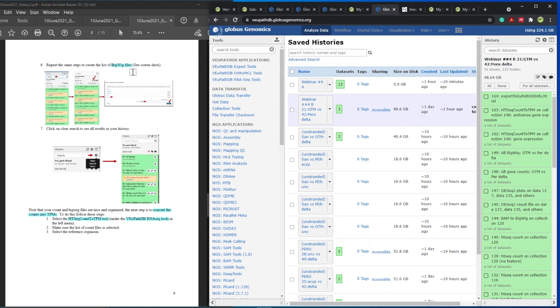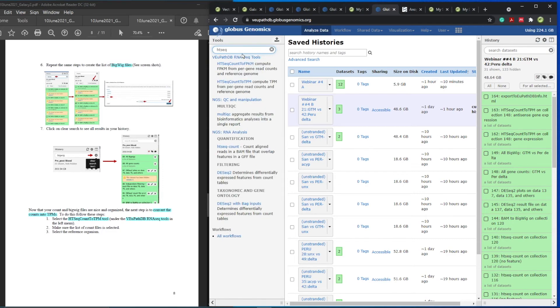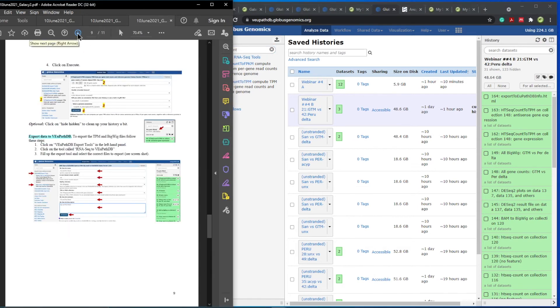You are going to do the same steps with BigWig files, which you can load in the VectorBase genome browser. To convert your data and send it to VectorBase, come to 'VectorBase export tools,' click on RNA-seq HTSeqCount to TPM, and it will ask which dataset you want to send. You send all your BigWigs and all your gene counts to VectorBase. Once you do that, they will appear in your workspace under my datasets.